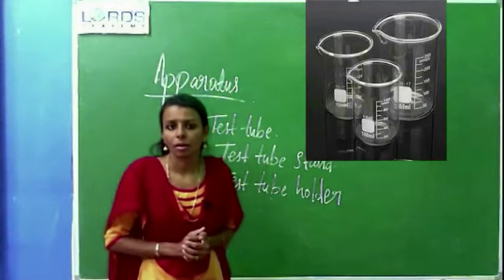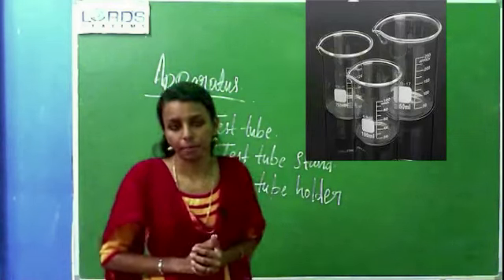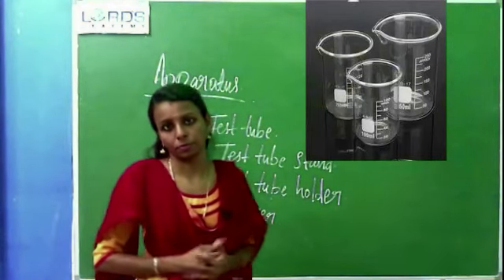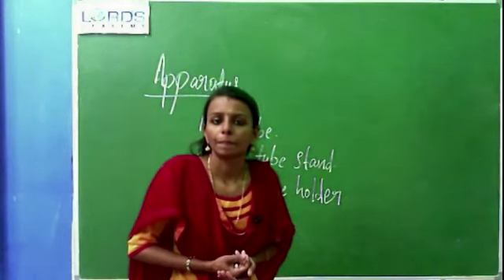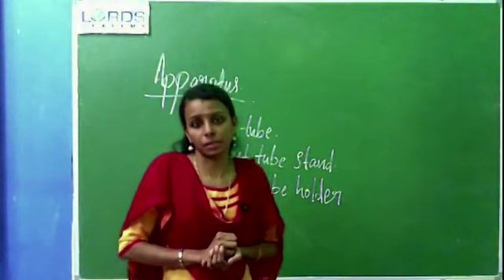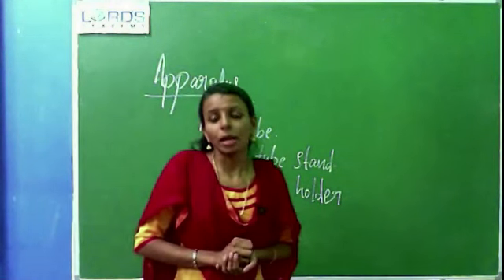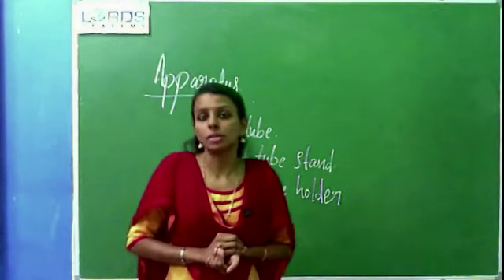What is that? Yes, beaker. This is a beaker. The beaker is made up of glass. Then what is the use of this beaker? The beaker is used to keep the solutions and prepare the solutions.